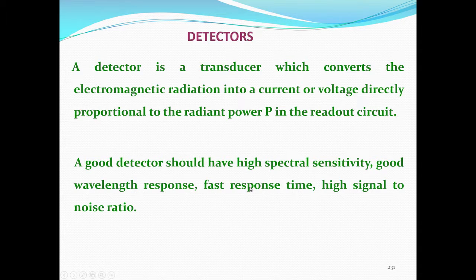So, fast response time is very important, and then what we need for a good detector is a high signal to noise ratio. If the noise is very low, the signal will be high.